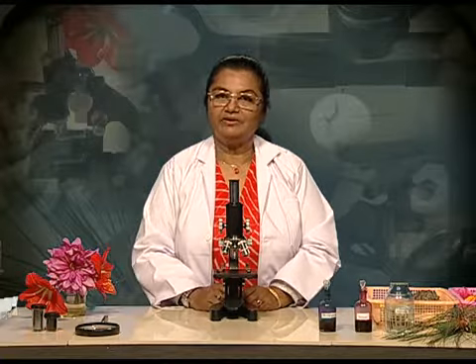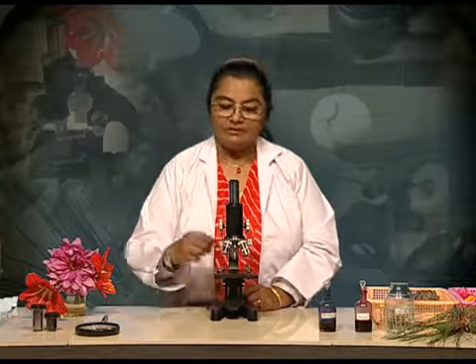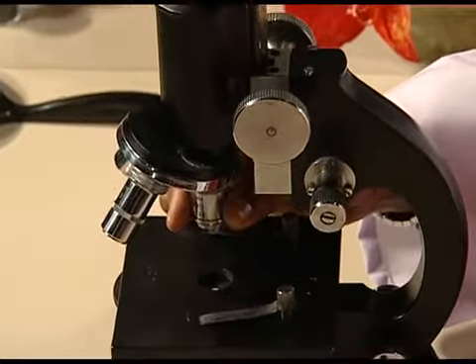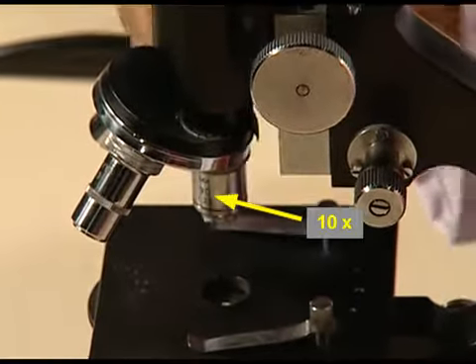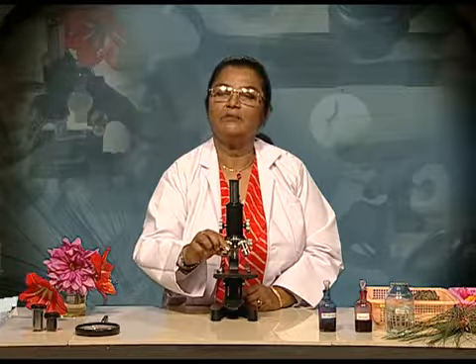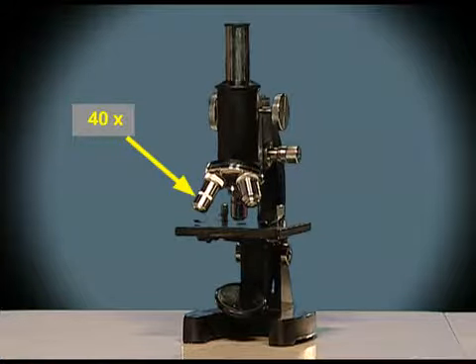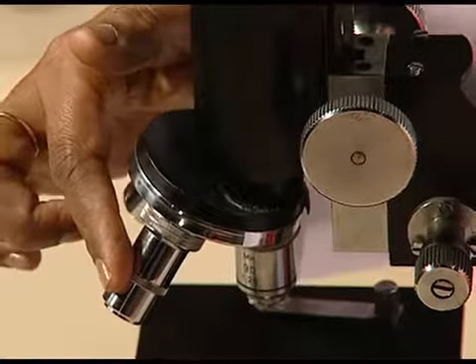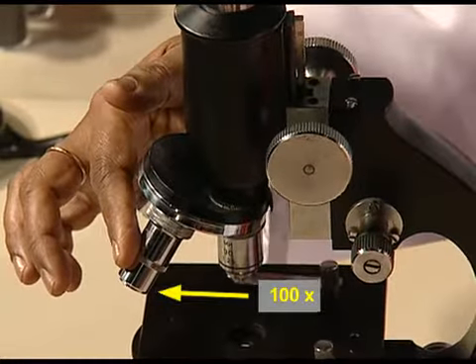They are generally of three powers. The low power, which gives magnification of 10 times, therefore it is labeled as 10x. The medium lens power, which gives a magnification up to 40 times, therefore it is labeled as 40x. And the high power objective lens, which gives a magnification up to 100 times.